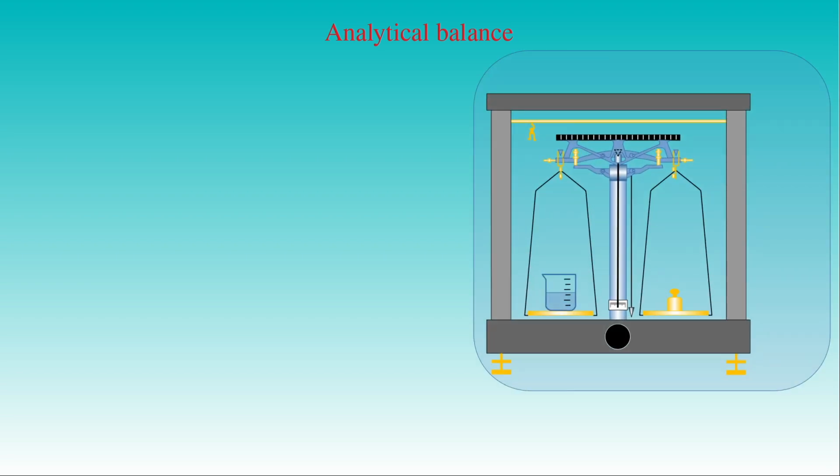Its main component is a central balance beam with a sharp steel knife edge attached to the beam. The axis of rotation of the beam is determined by the contact points of the knife edge and the top of the central pillar of the device on which the edge is balanced. 2 knife edges turned upside down are balanced on both the ends of the central beam, where the axes of rotation of the knife edges can be adjusted by balancing screws.